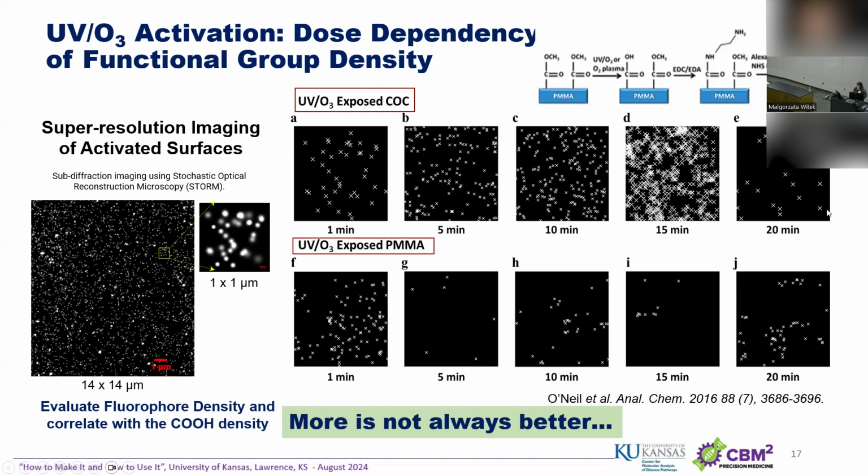But when you pass 20 minutes, it decreases. That's exactly what happens: you cross that threshold of 13, 15 minutes, and you start destroying the functionalities.